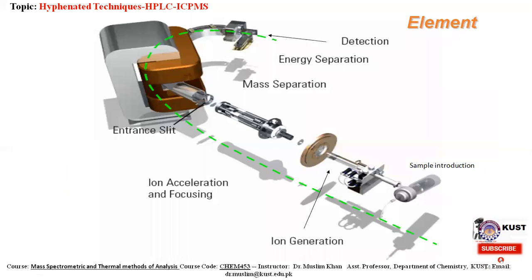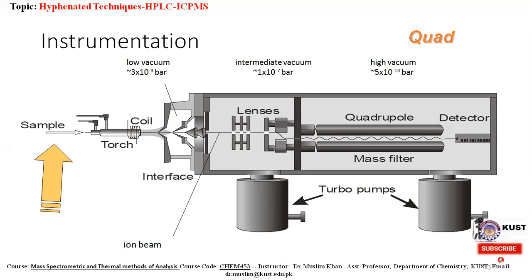via the sample injector. It is important to differentiate the role of the plasma torch in an ICP-MS system compared to ICP-OES. The plasma is formed exactly in the same way, by the interaction of an intense magnetic field produced by radio frequency passing through a copper coil on a tangential flow of gas, normally argon at about 15 liters per minute, flowing through a concentric quartz tube.